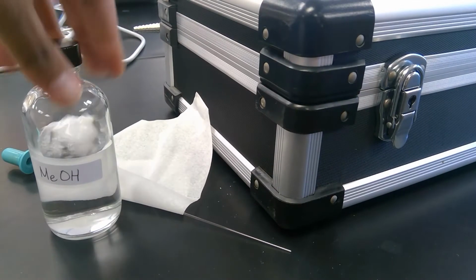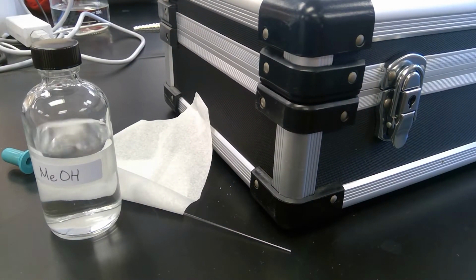So here we have the methanol, CH3OH, or we can use the abbreviation ME, which stands for methyl. The Aldrich value for the refractive index of methanol is done as well at 20 degrees Celsius, and it has a refractive index of 1.329. The CAS number for methanol is 67-56-1.